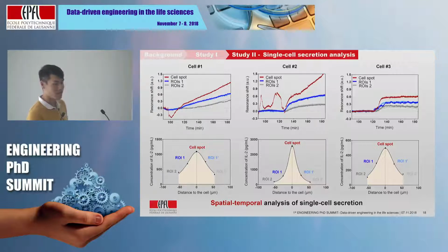Nice presentation. Thank you. Compared to the in vivo microenvironment and the secretion profile of cancer cells there, do you expect a deviation on your chip because of the mechanics and also because of optics? Like the fact that you have laser beams and energy provided into the system may change the temperature, maybe. Can you comment on the environment that you create and the implications for secretion?